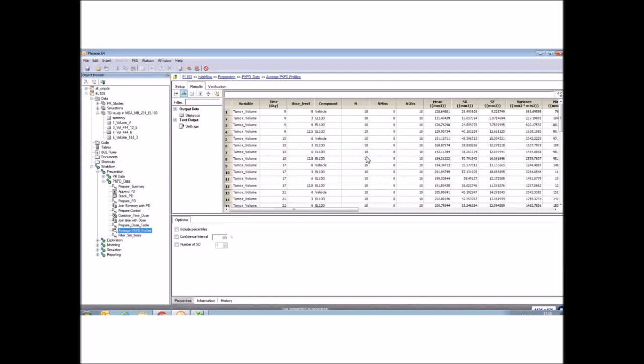And as with PK data as well, we generate some mean profile data also for the tumor volume data. So we got some mean profiles here. And the next step is also more optional. It's just extracting the time points for tumor volume measurements, and this is also required for some modeling when we try to simulate some different dosing regimens. So this is all what we need to do for preparation. Everything is now ready for the modeling stage.